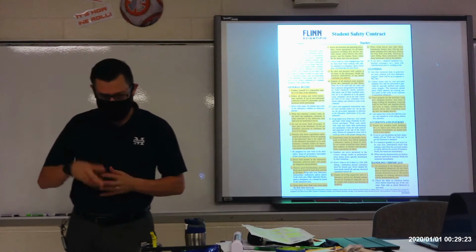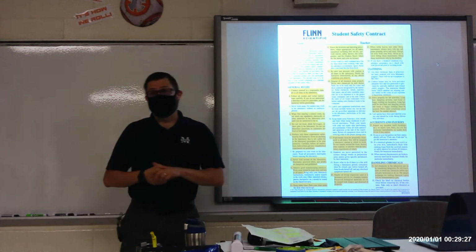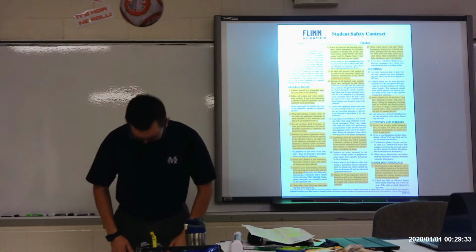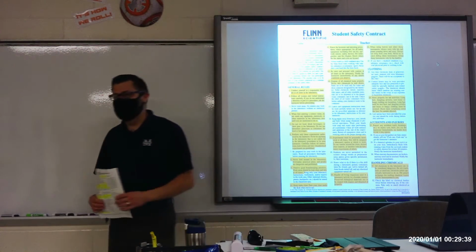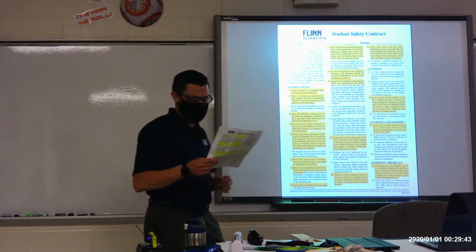If you lean over and your hair falls into flame, it is likely to catch on fire. But the thing that happens most often in this class is we'll be doing a dissection, and somebody with long hair will lean over and their hair will fall right into the frog guts. And then you get to walk around smelling like frog guts for the rest of the day. So again, I would suggest having a hair tie that you can tie your hair back in that instance.